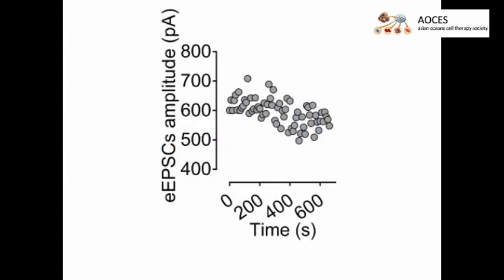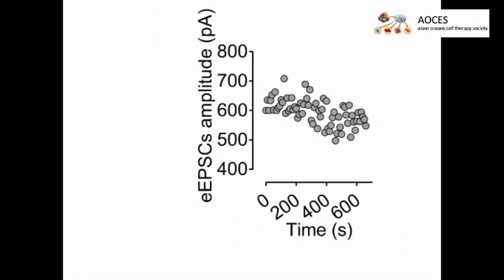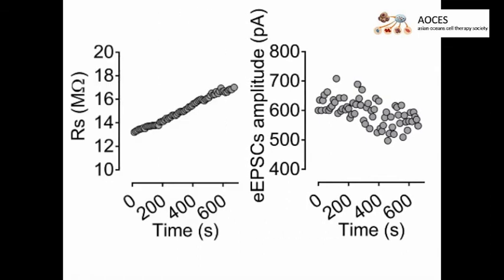Here, the evoked EPSCs amplitude is assessed in the voltage clamp mode at minus 80 millivolts. When series resistance increases, the amplitude of evoked EPSCs decreases.